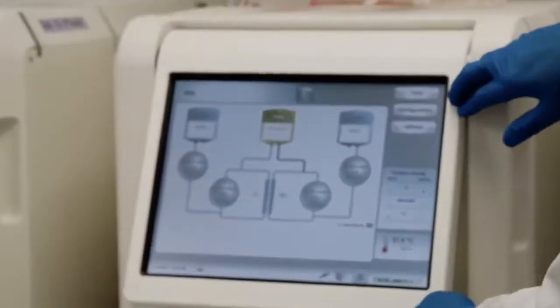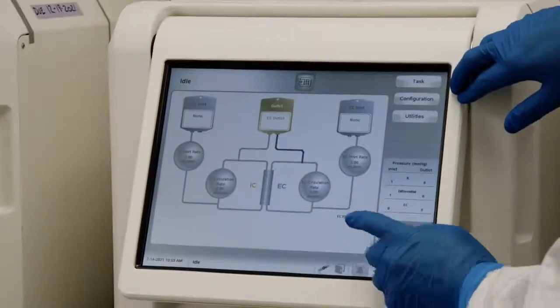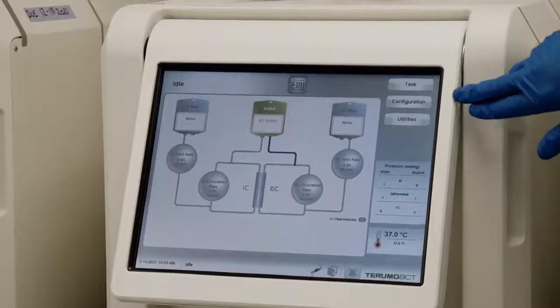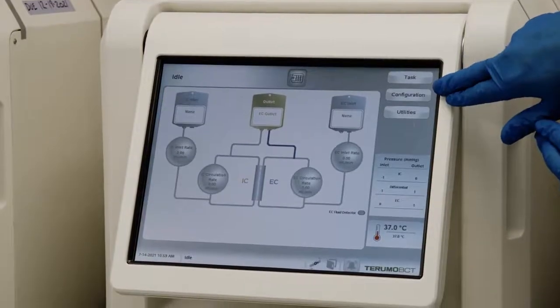On the touchscreen, you can monitor the run status and settings, the fluid pathway, the rates, the temperature, and you can command the system to run a task or to configure the device.